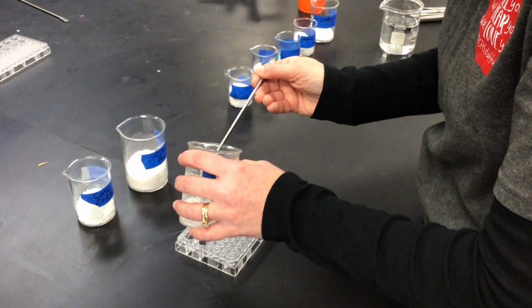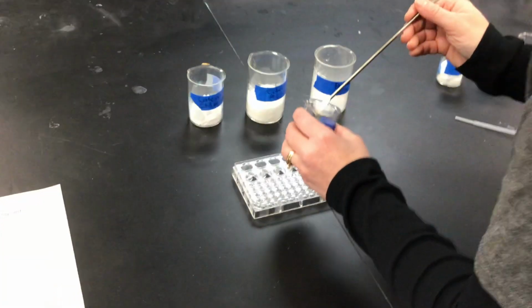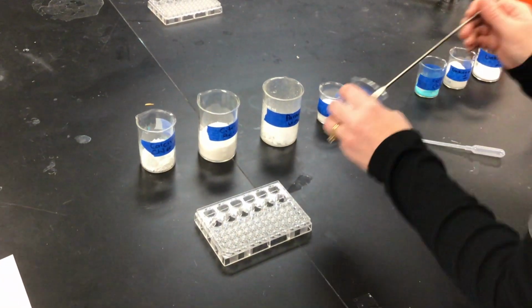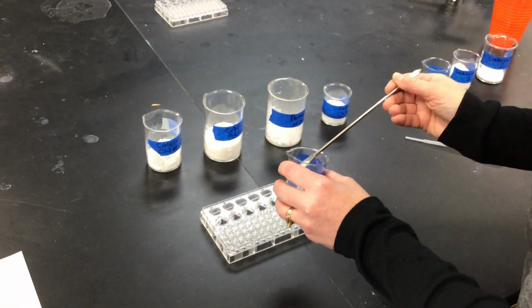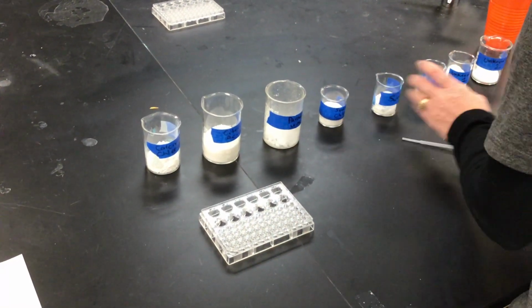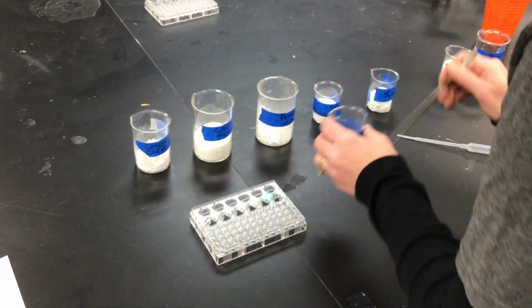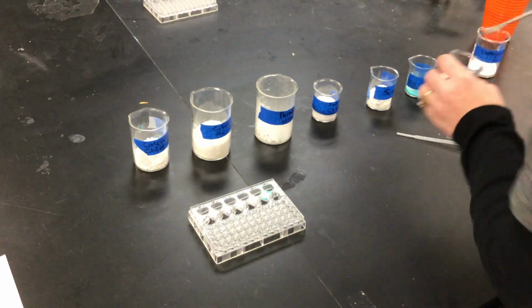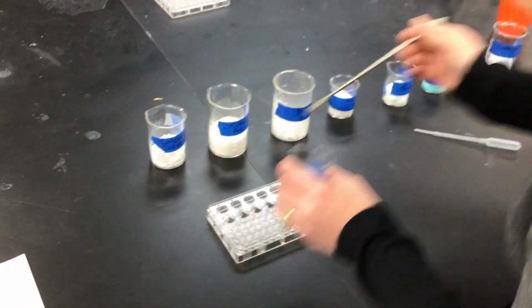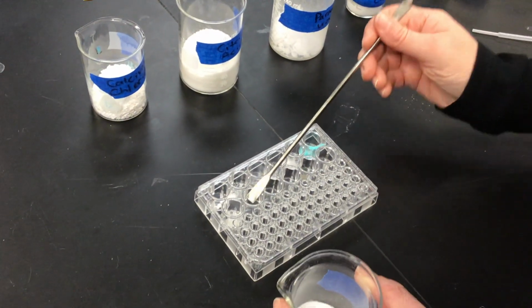Number 3 is paraffin wax. 4 is sodium chloride. Okay, next is sucrose. Number 5 is sucrose. 6 is copper chloride. 7 is unknown number 1. And 8 is unknown number 2.